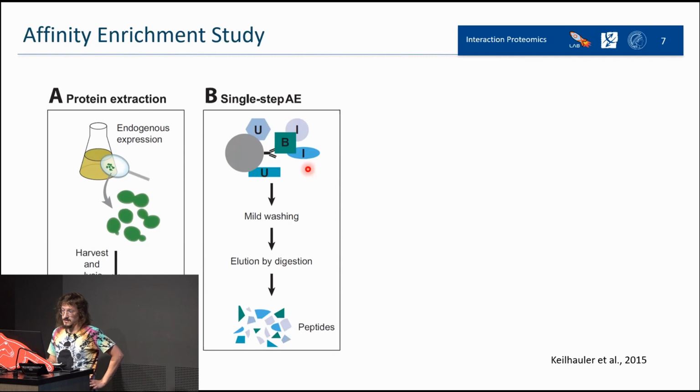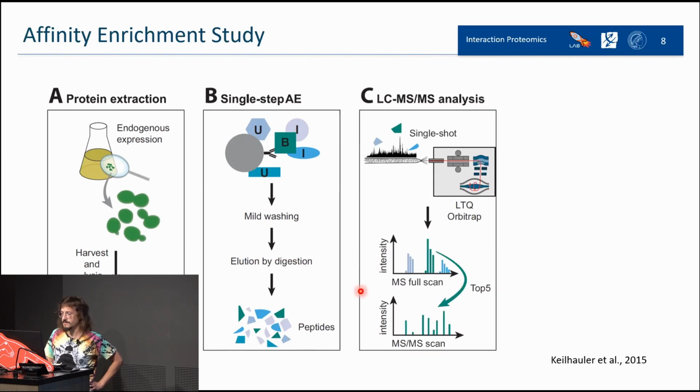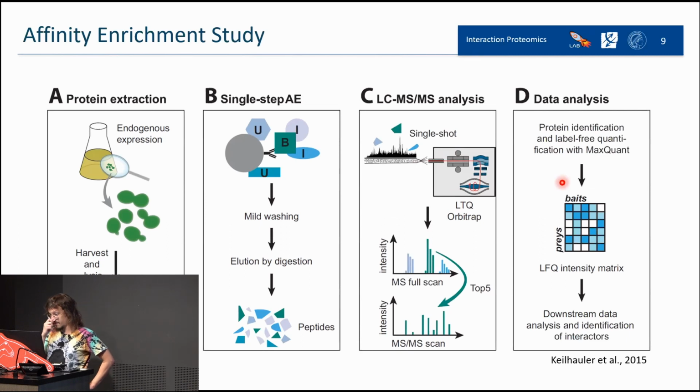And then you see, written with I, the specific binders, and with U, the unspecific binders. They didn't care about the unspecific binders. They just performed a mild washing. In case the bait was not present, everything will be washed out. Then they digested all the proteins and continued with the mass spectrometry. Just a few technical details if you want: they performed it with an Orbitrap, but we're not specifically interested in this. Thanks to bioinformatic analysis, they managed to get rid of the signal coming from unspecific binders.